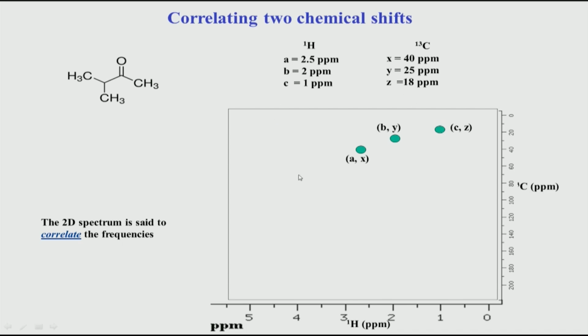Okay. So, this is an example of what is called a heteronuclear NMR experiment. Why hetero? Because we are connecting a carbon with a proton. If I have proton on both sides, y and x, we will use the word homonuclear. Homonuclear means same nucleus, same type, that is hydrogen and hydrogen. If I use heteronuclear, it means hydrogen and carbon. It can be carbon carbon also. So, carbon carbon on both axes can also mean homonuclear.